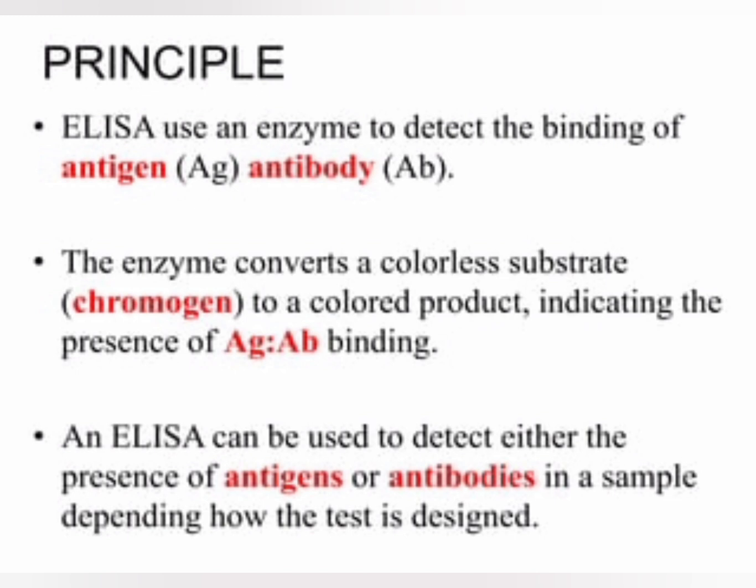This results in the generation of a colored, fluorescent or chemiluminescent product that is measured using a specialized plate reader. The values obtained are compared with the values obtained for the same set of reactions with known antibody 1 concentration of antibody used to prepare a standard curve, giving us the concentration of first antibody in patient sample.